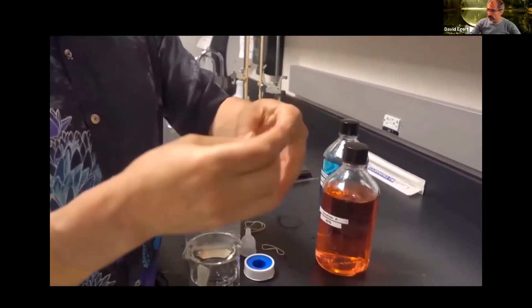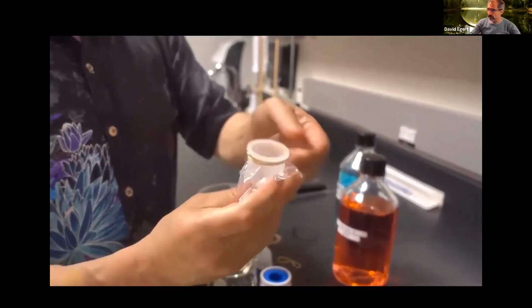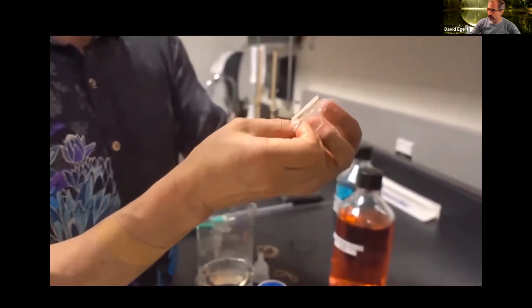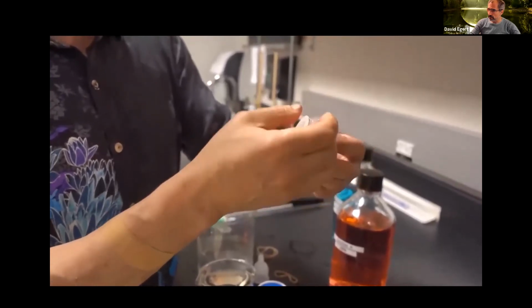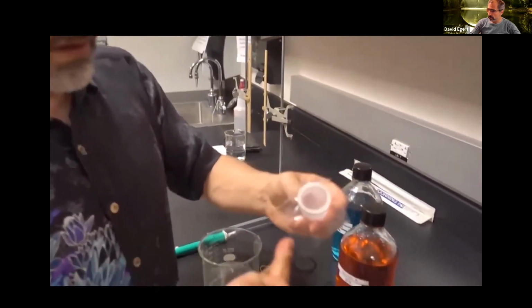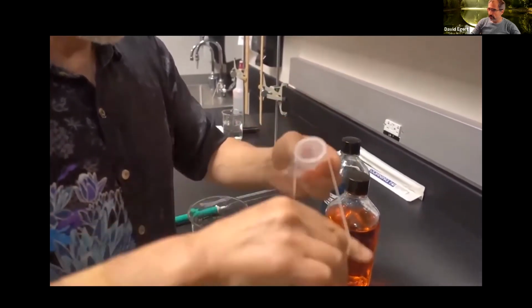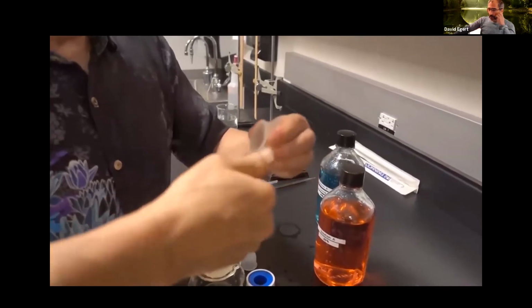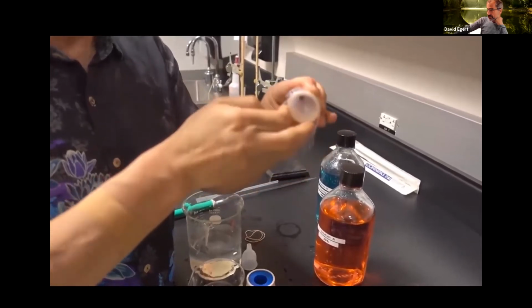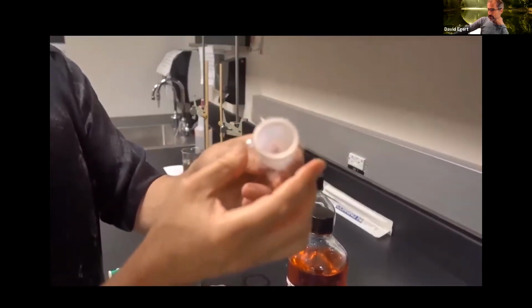So any weakness is going to end up with water and sugar leaking out where it shouldn't. So I am basically right now pulling this membrane really tight, making sure that it's right up against the lip, making sure that there's no leakage points. I'm going to take another rubber band and put it around, oops, again. I can't overemphasize how easy it is to have this experiment fail if you do not seal this really well. So there's two. I think this is probably enough. You could even do a third if you want.